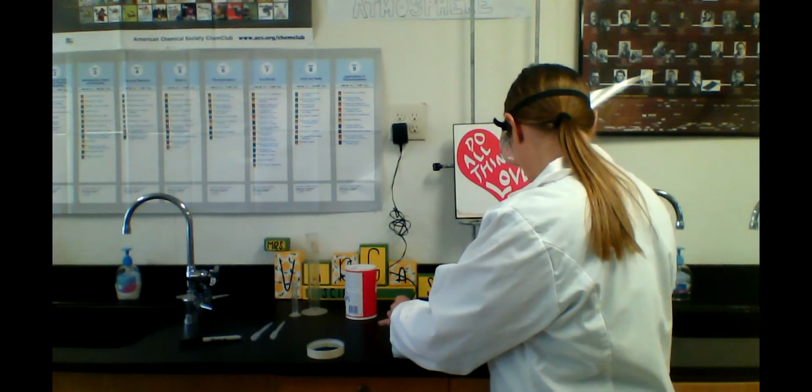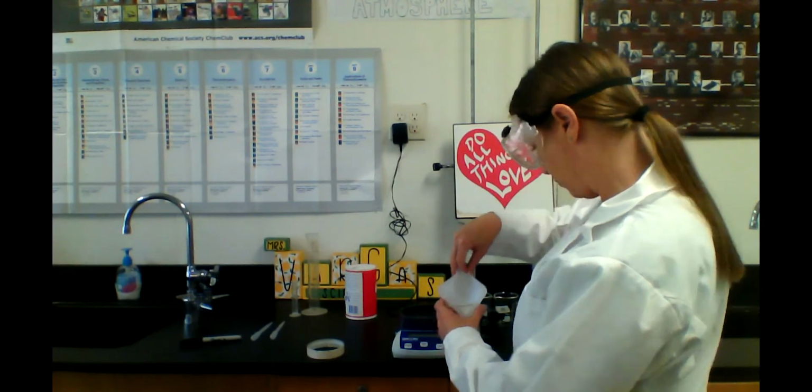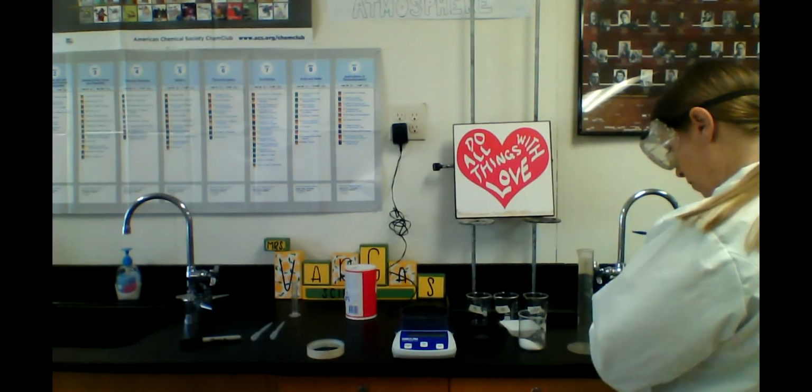And I'm going to go ahead and put that into my beaker here that I have labeled with the 25. I should add the percentage on there, 25%. And to that, since we are measuring by mass, we want a total of 100. So I'm going to have 75 milliliters of water, and I'm going to pour most of it.